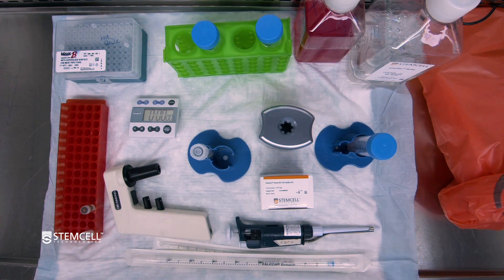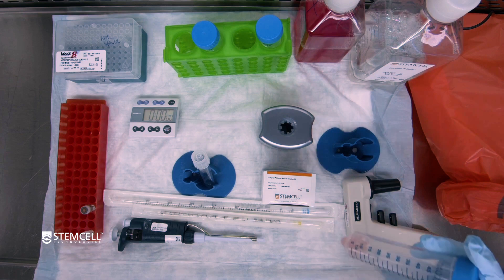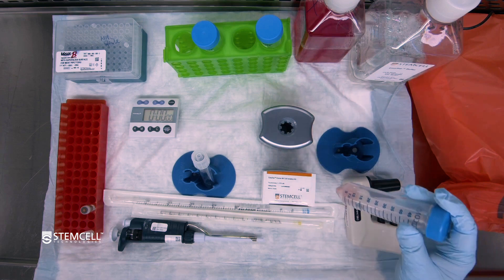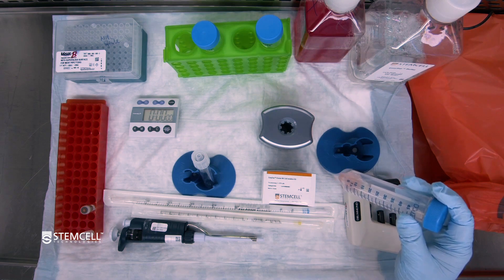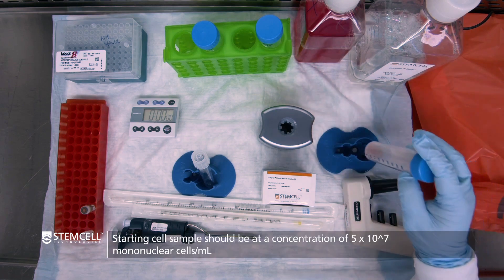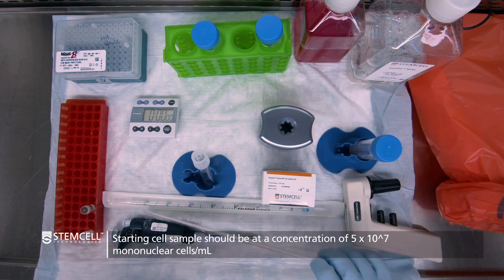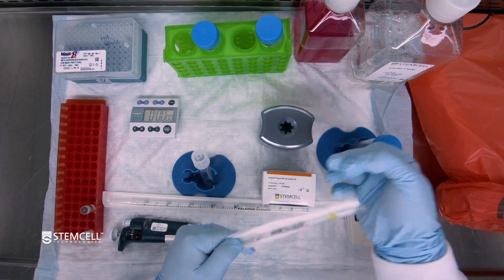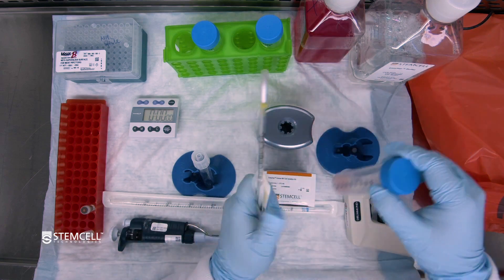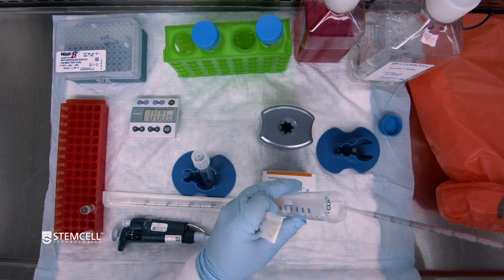Take note that all steps in this procedure will be done at room temperature. First, prepare the mononuclear cells to the prescribed cell concentration, which for the 17955 kit is 50 million nucleated cells per ml in EasySep buffer. Once you've adjusted to the right cell concentration, you can assess how much total volume you have and take out however much volume you will be using for the isolation. In this case, we will be using 1 ml.